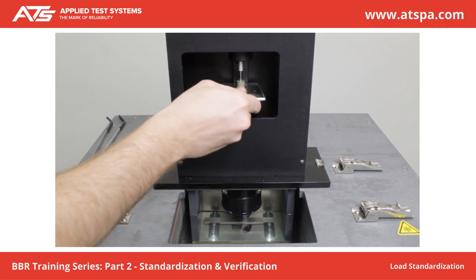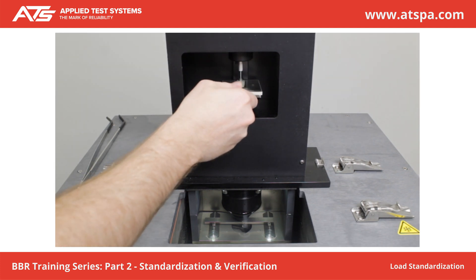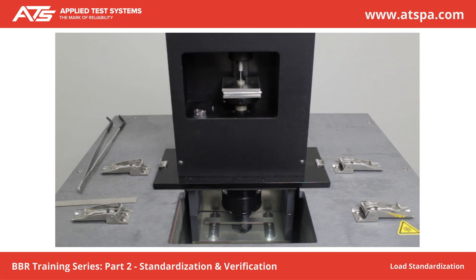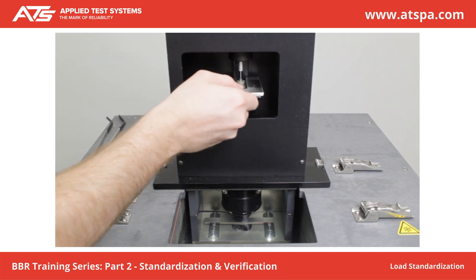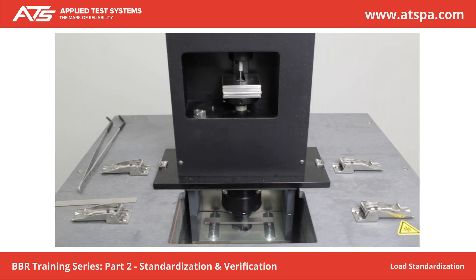Place Weight B on Weight A. Wait 5 seconds. Press Next. Place Weight C on Weight B. Wait 5 seconds. Press Next. Place Weight D on Weight C. Wait 5 seconds. Press Next. Take note of the calibration constant. Press Finish.